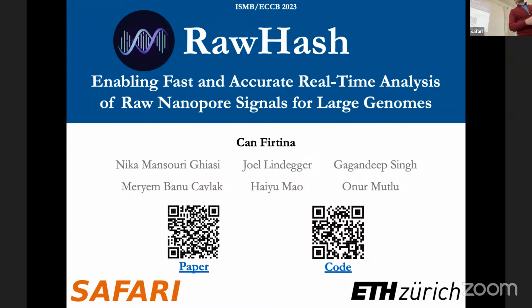We take this stopping decision because we assume that even if we keep sequencing, the end result after sequencing fully will be very similar to what we have now, because of that history of information we generate. And this is mainly because we assume that the order of the reads being sequenced is random.